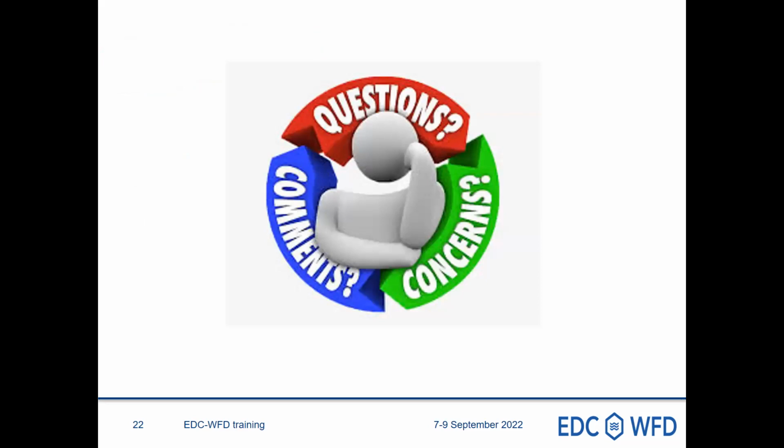Do you have questions or comments about, first, the strategy of the validation? Because perhaps some concepts are new to some of you. Do you have feedback or perhaps comments on this strategy? Our purpose was really to operate not as a research laboratory, but really to be faced with the same issues as routine laboratories that have to have accreditation and provide elements and proof to the accreditation body.